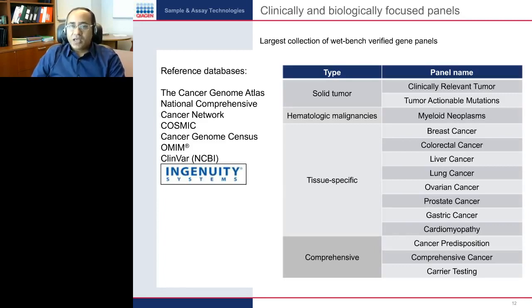All these panels have been developed with a lot of work to ensure that we include only the genes which are biologically and clinically relevant to a specific disease.